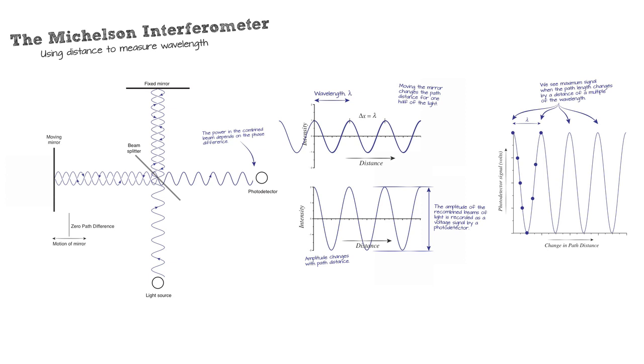By causing the light to interfere with itself because of the changing path length of the mirror, we can create a system where we can measure every single wavelength that's in that light using electronics. And that's the key. Everything that happens to the spectrometer has to be manipulated by electricity. It's not just you looking at it and going, it's blue! No, it has to be manipulated by electricity, and a dumb computer, which does not have a clue what blue is, will give you a number for the wavelength. And I guess this is redder than red because we're in infrared, aren't we?